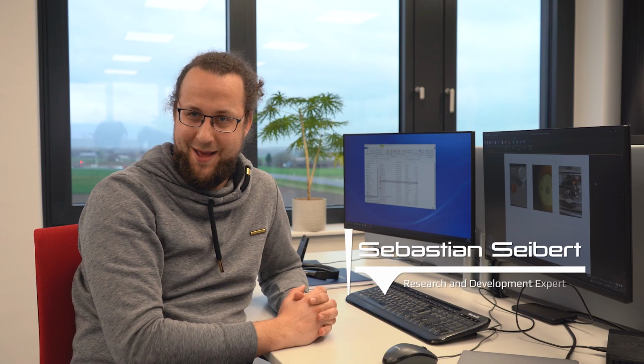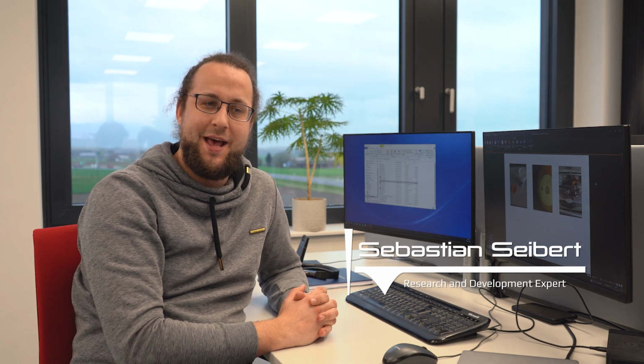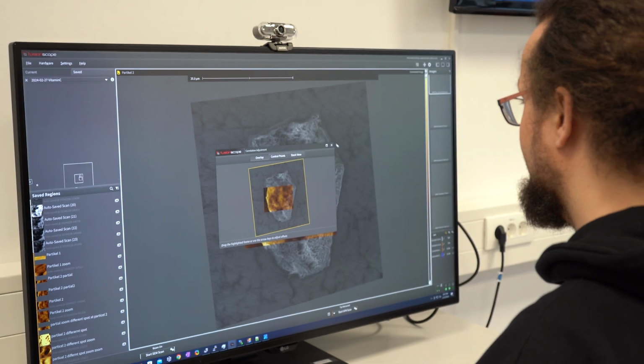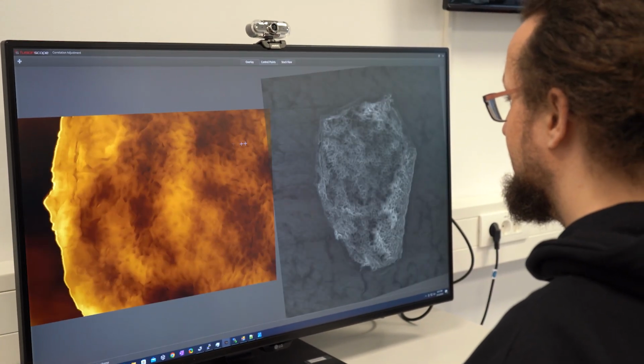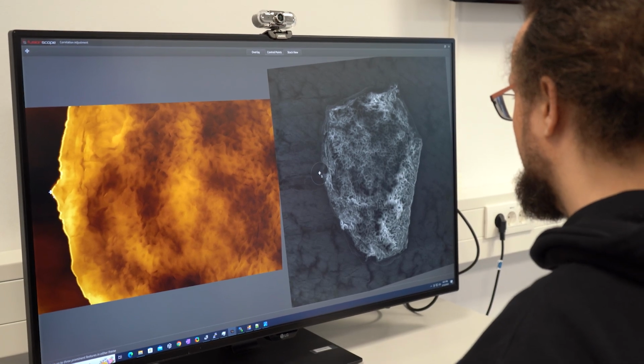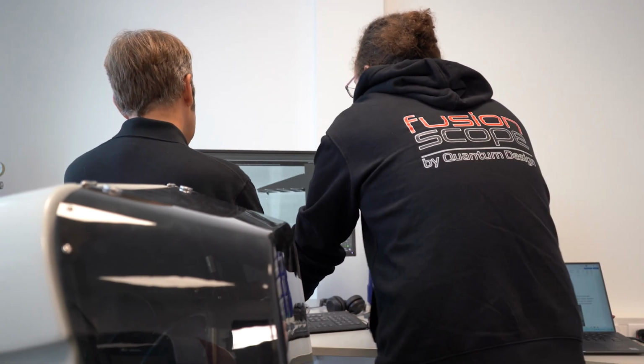My name is Sebastian. I'm working here at QDM, Quantum Design Microscopy, in the Research and Development department. The main work is I'm doing applications for showing what the benefit of the FusionScope is, but I also research new AFM modes.